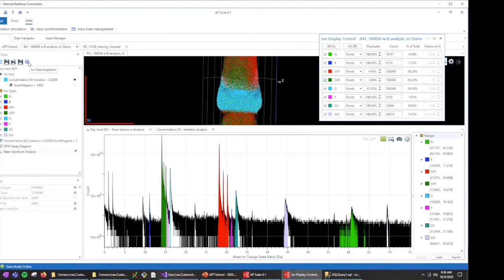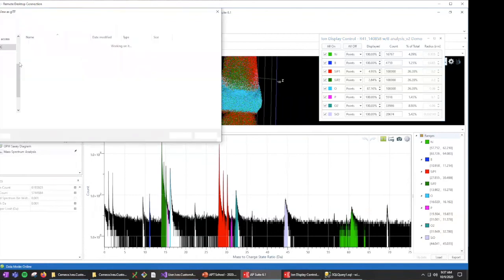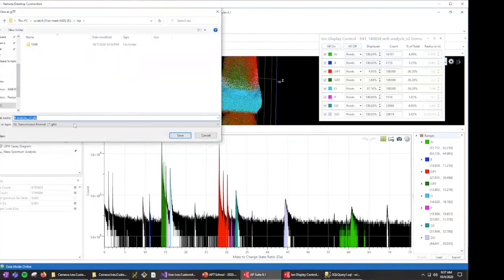We also have a brand new export format. So we're not exporting VRML anymore. We've moved to a new format, GLTF, which I haven't actually tried yet. Should we try it? It's a high risk demo in the middle of a meeting. I know, right? Like I said, brand new software. So GLTF is a newer standard for this sort of arbitrary 3D data.